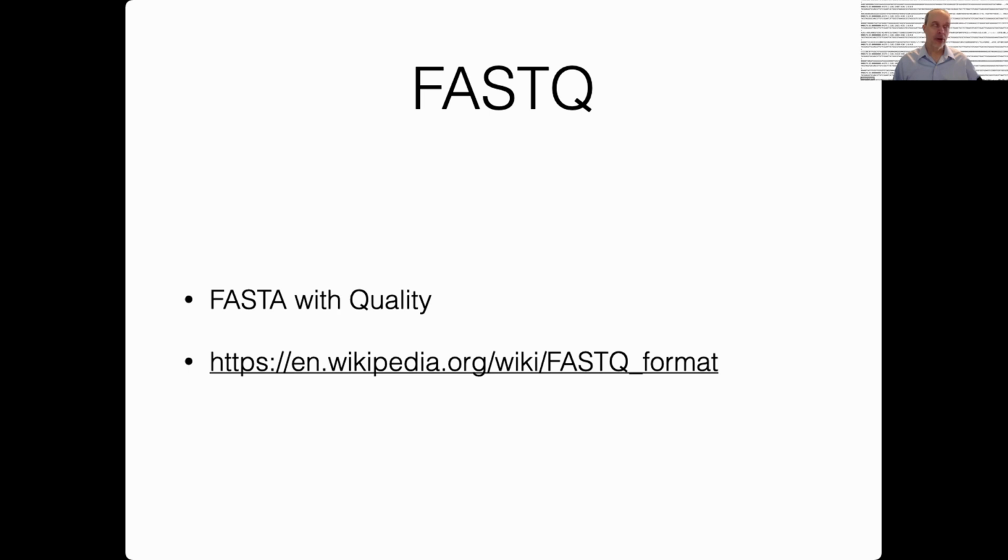And if you've ever looked at sequence data, like a sequence genome that you've downloaded from a database, it is almost always in the FASTA format. It's a very common format. FASTQ, the name comes from FASTA with quality, and we'll talk a little bit more about what that means in a second.